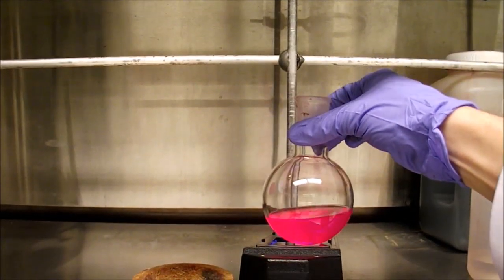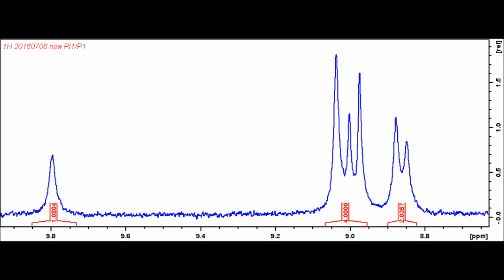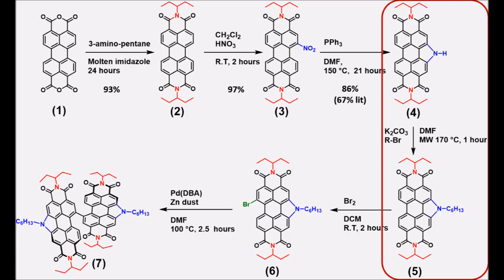Due to the poor solubility of this compound, the NMR spectrum is considerably more dilute than the previous compounds. As with previous compounds, we can see water and chloroform at 1.5 and 7.2 ppm respectively, both of which are due to the solvent that NMR is run in and are not impurities in this product. The aromatic region shows three peaks, with the leftmost corresponding to the NH proton, and the other peaks corresponding to the other six aromatic protons.